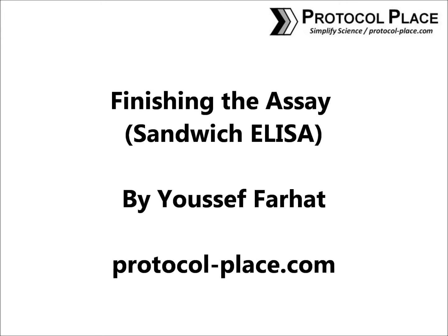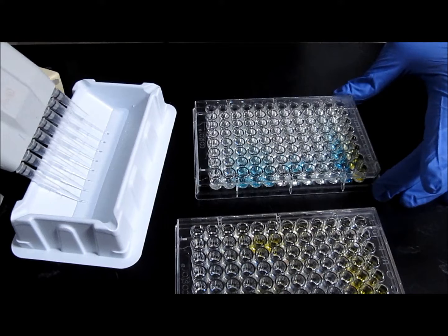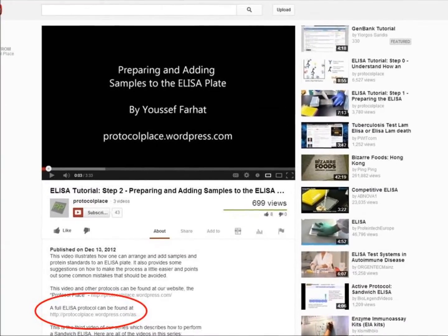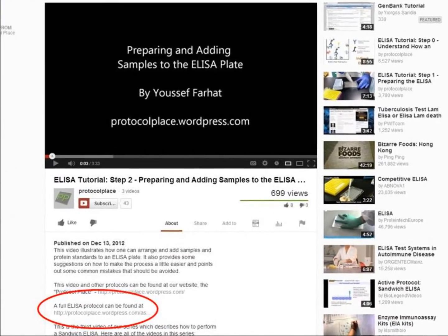Finishing the assay. In this video we are going to perform the final steps of an ELISA. Our detailed ELISA protocol can be found on the website which is linked in the video description.